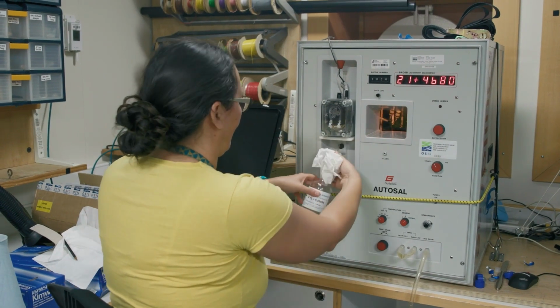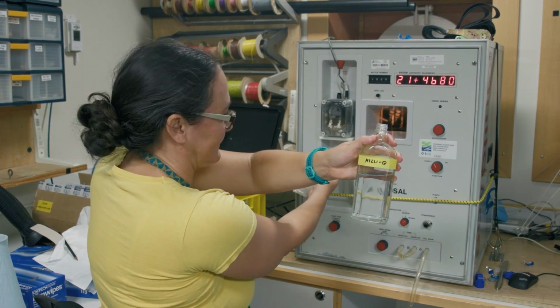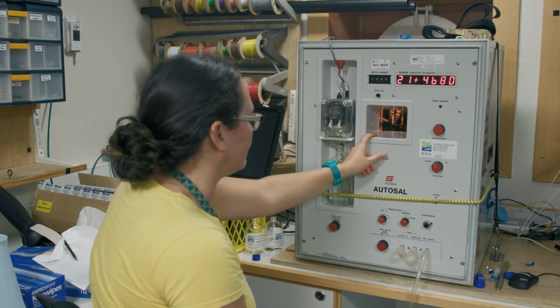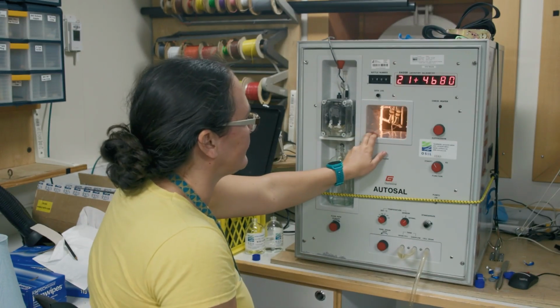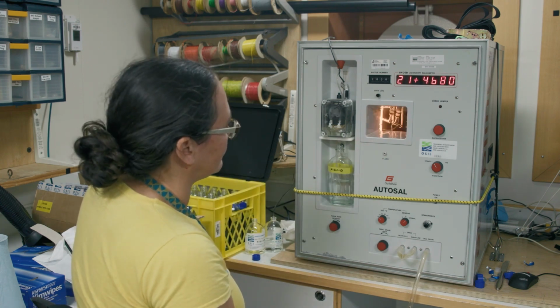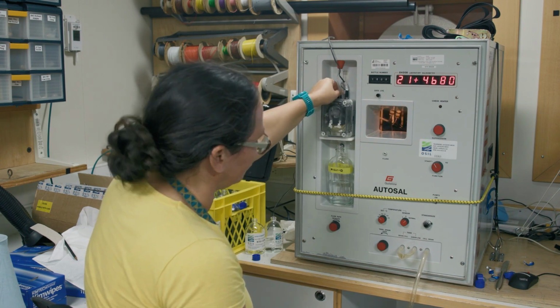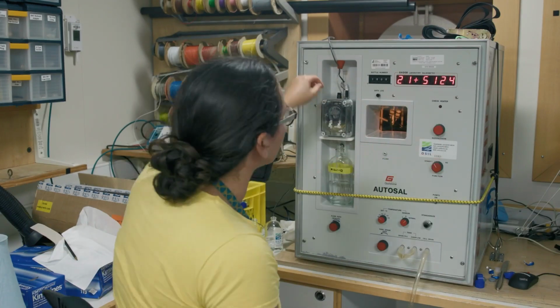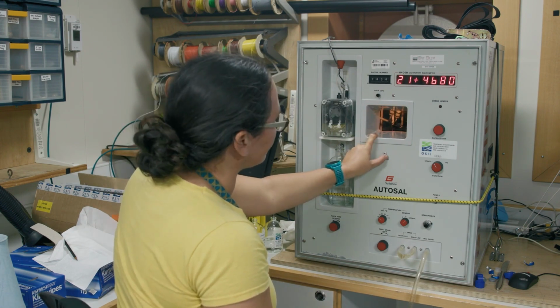When you're finished and are going to leave the machine for a while, then refill the cell with distilled water. Here we want to flush through most of a sample bottle volume of deionized water. We can turn the pumps up all the way in this case and keep flushing and filling repeatedly. Now let's check. Turn the peri pump off, switch to read. We'll need to turn the suppression down because it's already much fresher than the standard seawater. We're getting close to 0, but we'll do some more flushes and fills.